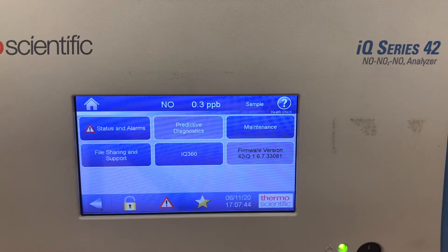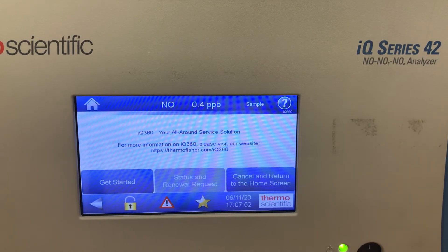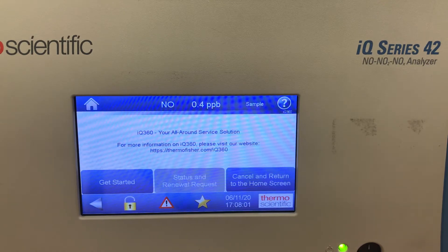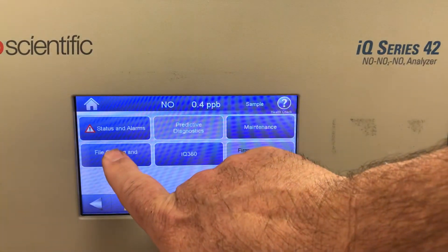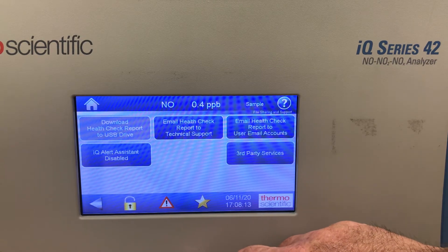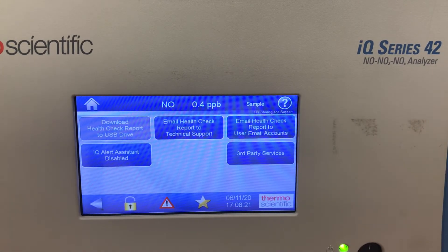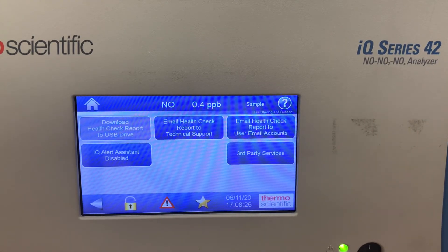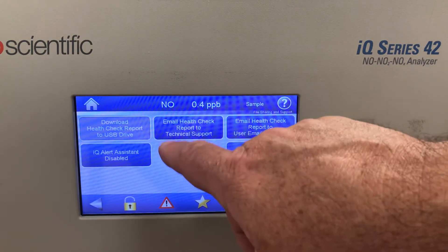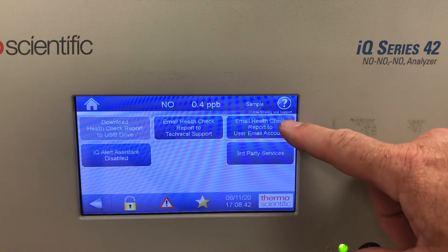This instrument also has a health check. There's the IQ360, a service that Thermal provides where they monitor the instrument 24/7 — if there are any alarms, they'll contact the operator and work out the issues. It also has file sharing and support. You can plug in a USB thumb drive, download the health check, and get all the data — maintenance records, service checks, alarm menus — onto a drive to review on your laptop. You can also have the health check emailed to technical support or Thermal if the instrument is connected to the internet.